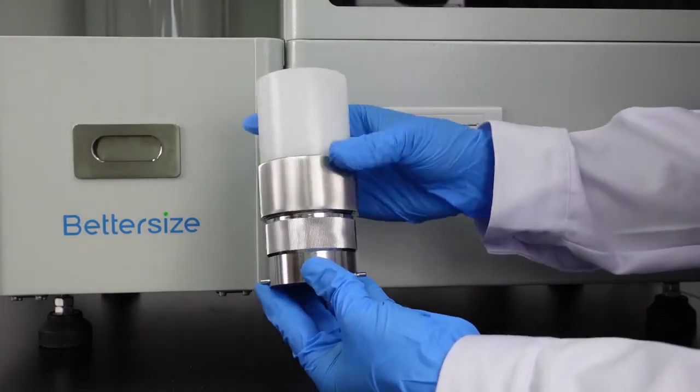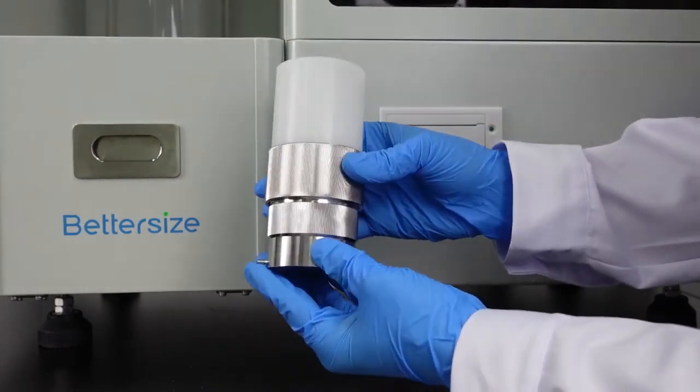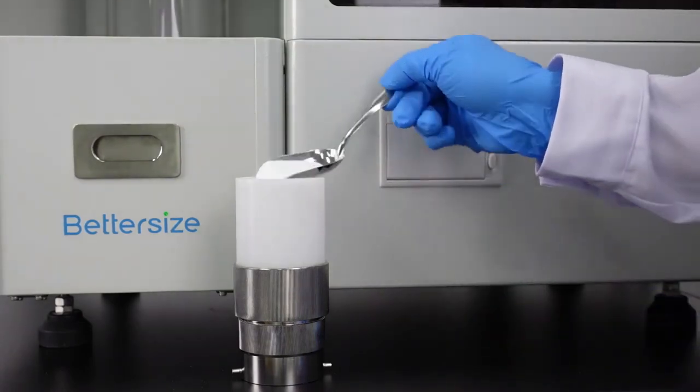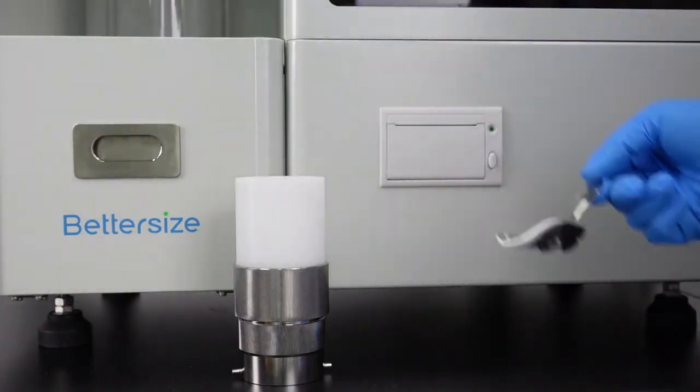Install the extension tube on a 100ml container. Add the sample to the cylinder. The amount of sample should be more than half the height of the extension tube.